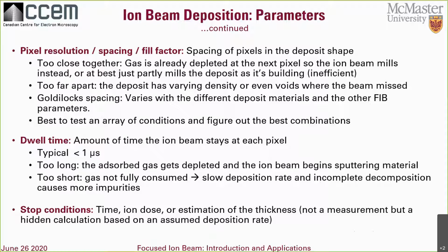Okay, next. Can you comment on the practical aspect ratios of the milled features in patterning with the ion beam? I assume this is not XY, but more like XY versus Z, like how deep you can mill. Yeah, so if you want to go deeper, a lower current is probably going to work better. That will give you sharper edge walls and allow more time for redeposited material to go out.